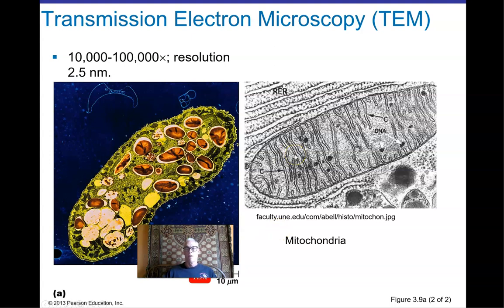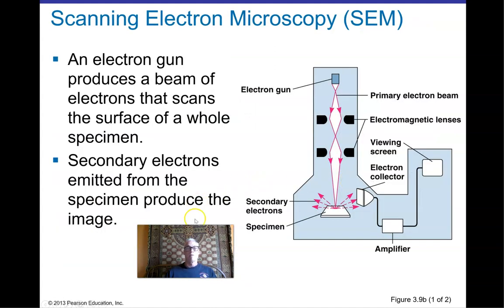Here's another picture of just a non-enhanced micro resolution image of a mitochondrion, and you can see all the layers, the inner and outer mitochondrial membrane, all the folds of membrane in there. Just remarkable. Pretty cool stuff. You can see endoplasmic reticulum with all the ribosomes against it and so forth. Very beautiful, a little bit esoteric.